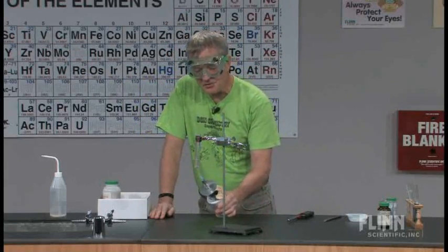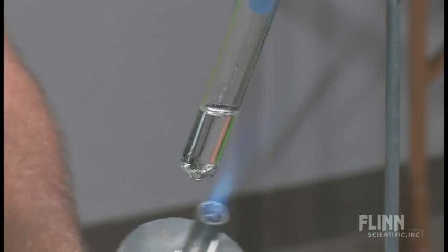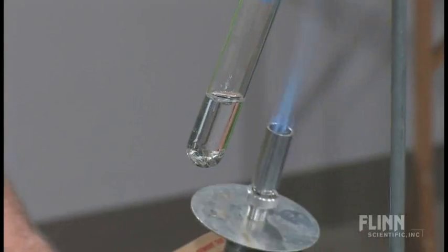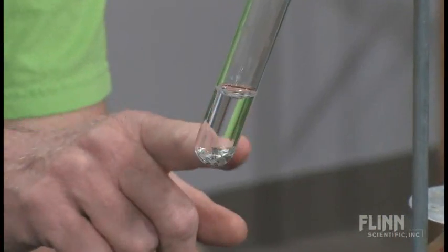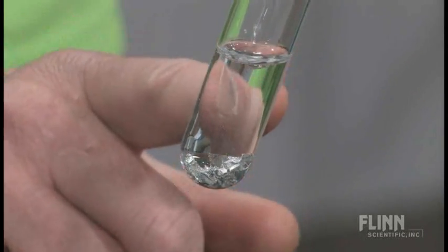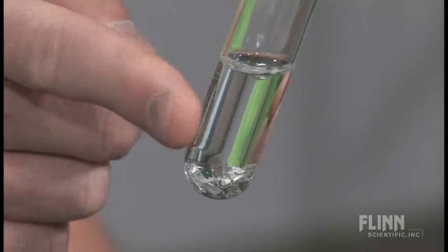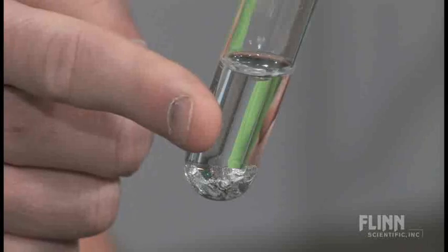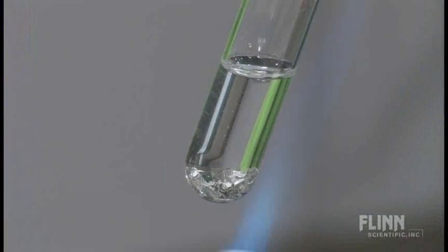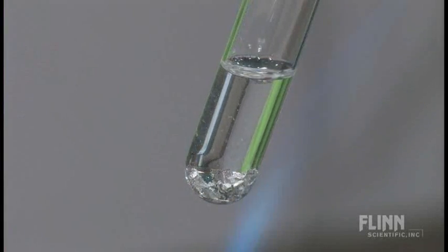And when you heat a test tube with a liquid in it from the bottom, you don't stick the Bunsen burner underneath it and incinerate the stuff, but you start out by gently heating it to give it a chance to warm up. And I think you can probably already see this, and this is kind of cool. See those bubbles? Now I'm going to do something I don't ordinarily recommend a lot, but I'm going to touch the side of the test tube. This really isn't all that hot. It's just a little bit warm. That's not boiling water. That's the magnesium reacting with the water and generating some hydrogen gas.